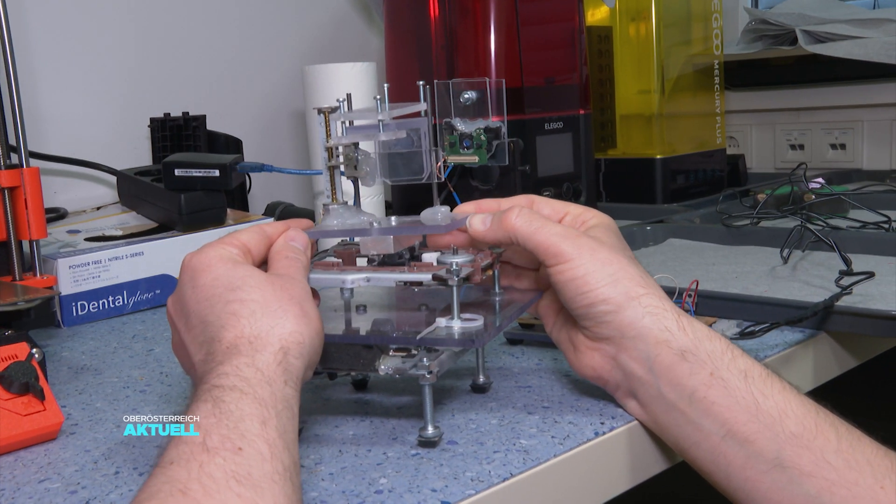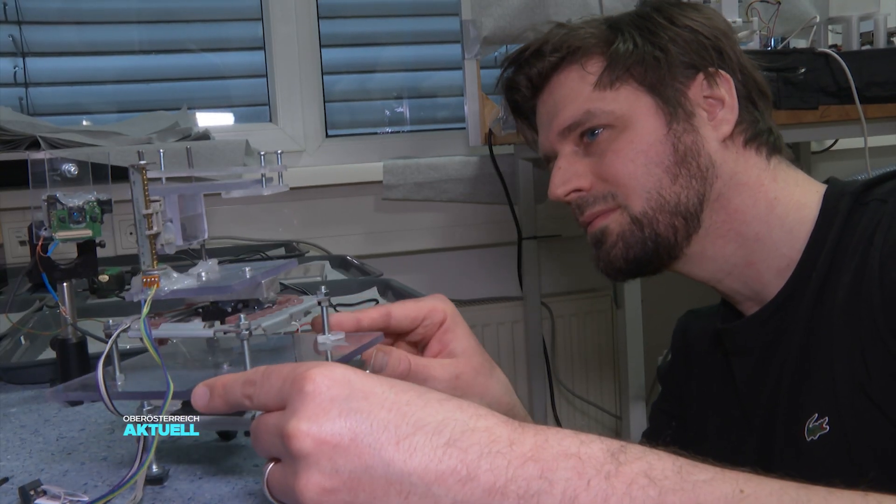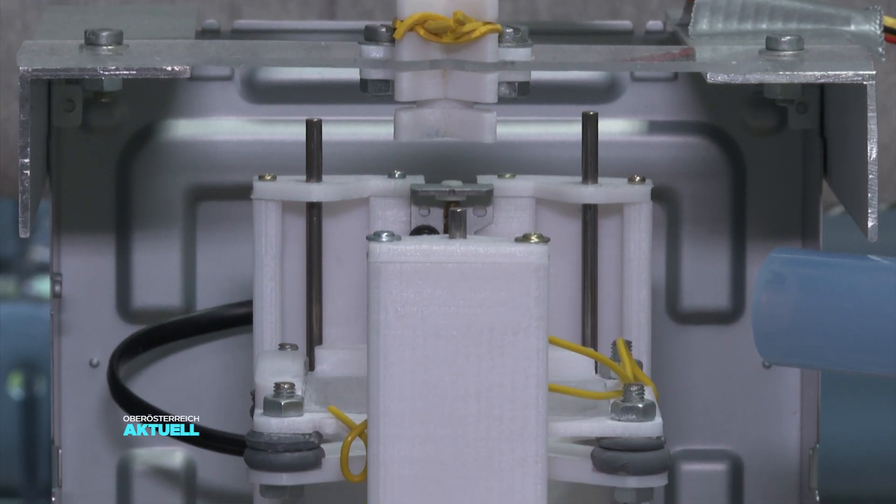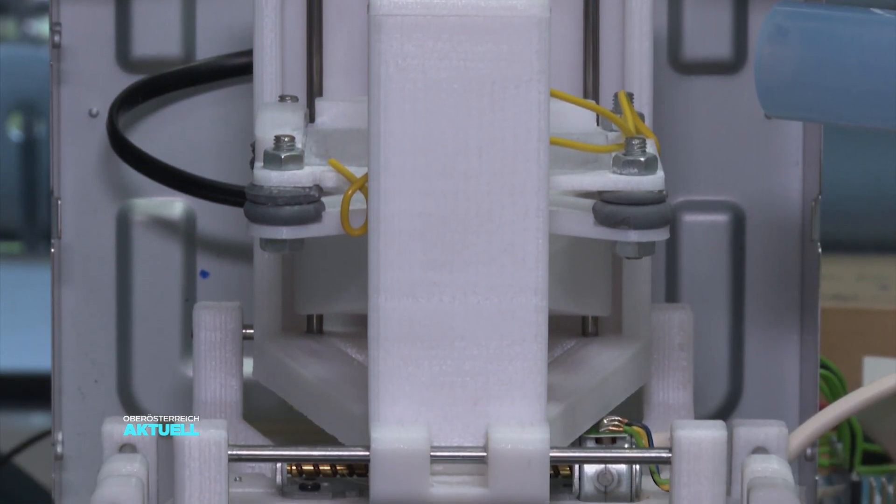The University of Applied Sciences team built it from a DVD drive. A DVD drive is a great design, and I simply combine numerous very cheap, high-quality components. Basically, I replaced the drives with small stepper motors and used them to build a 3D stage. The 3D printer is itself 3D printed. The challenge with 3D printing is simply that you must design the component to also be printable on the 3D printer, which means that no overhanging structures are planned.